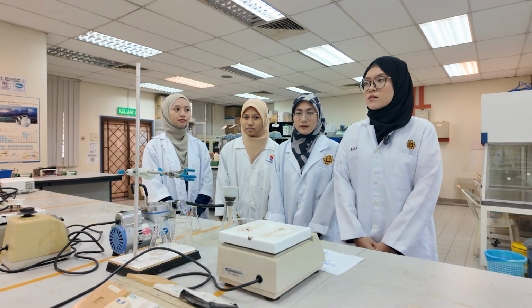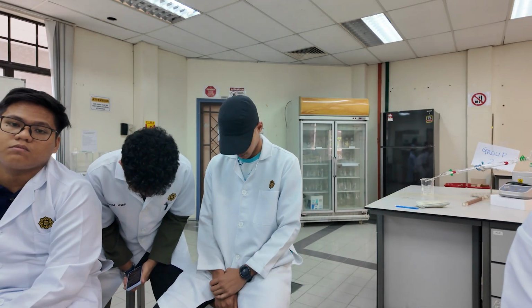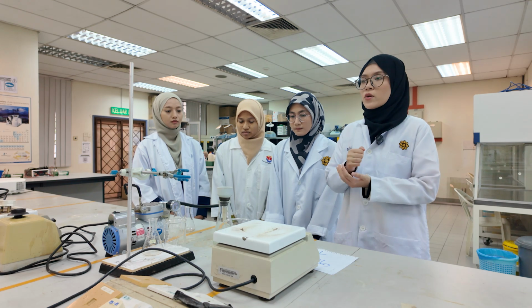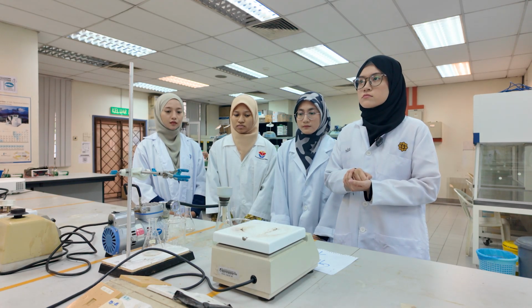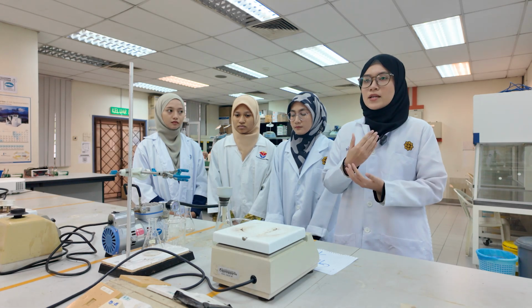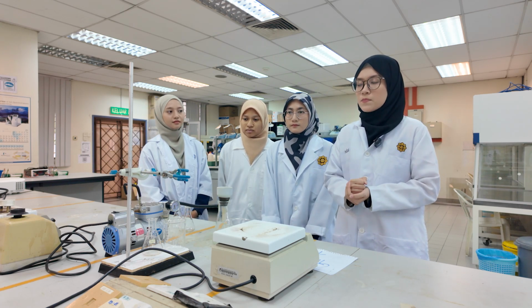Assalamualaikum everyone. Today our group 4 will present the recrystallization process. First of all, recrystallization is a technique for us to purify solid compounds, and this process is widely used in industrial and lab processes because it helps us to separate the compound from the impurities better.